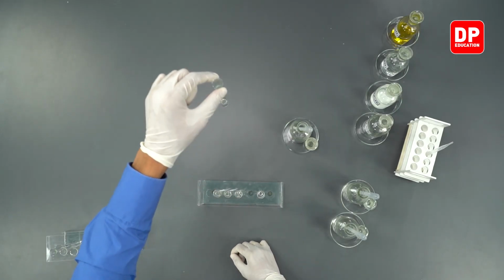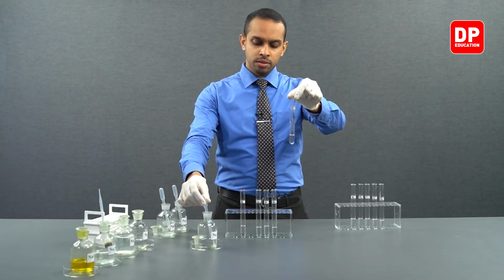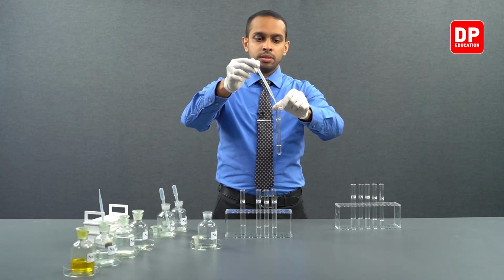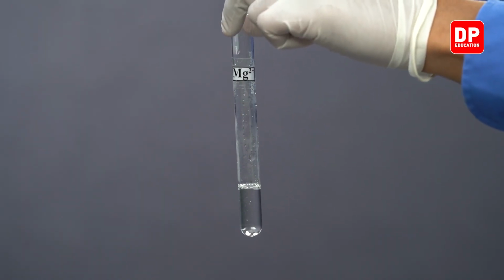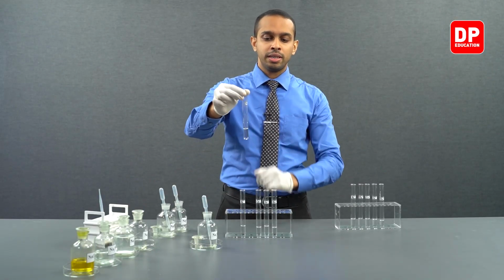Now let's move on to magnesium 2 plus ion solutions. We'll take a small amount of sodium sulfate and introduce sulfate ions by adding few drops of sulfate ion solution into magnesium ions.